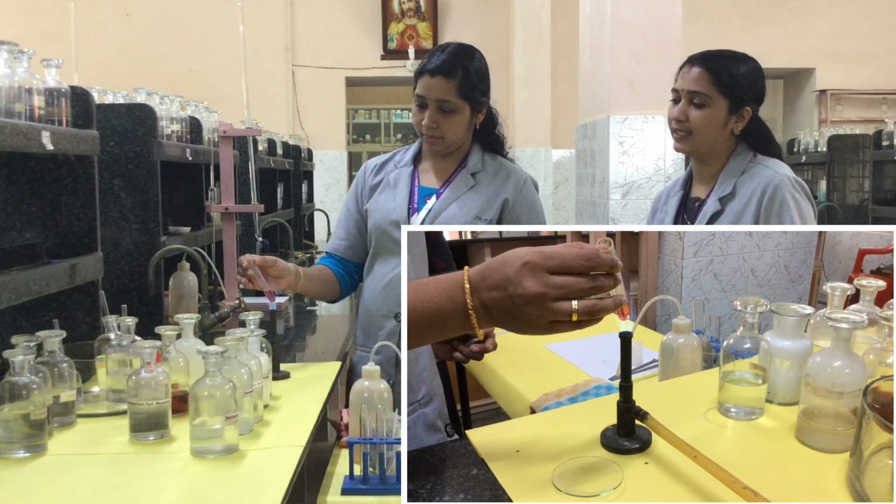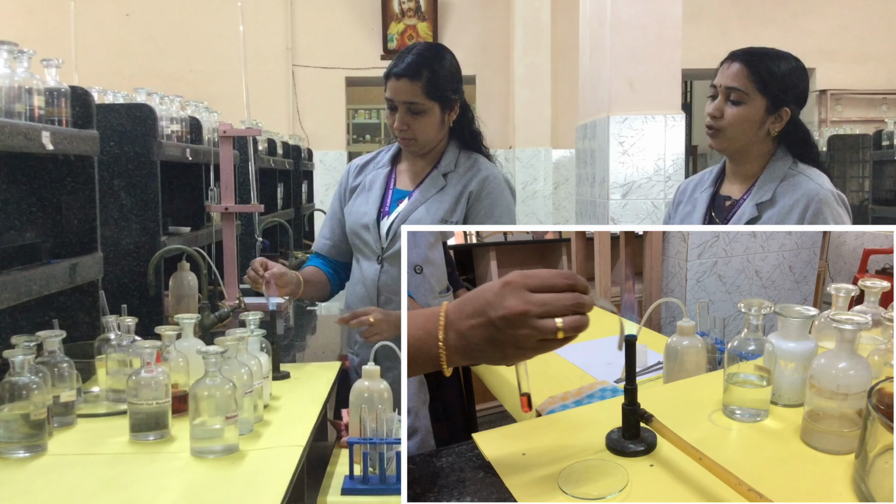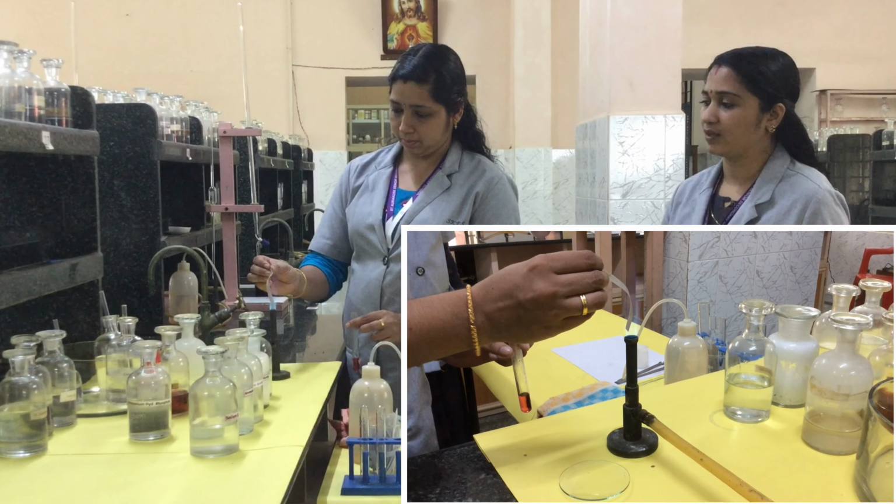Dip the filter paper in the solution and then burn the filter paper to get ash. Here, if magnesium is present, you will get a pink ash. So this is called an ash test. This is the second confirmatory test for magnesium.